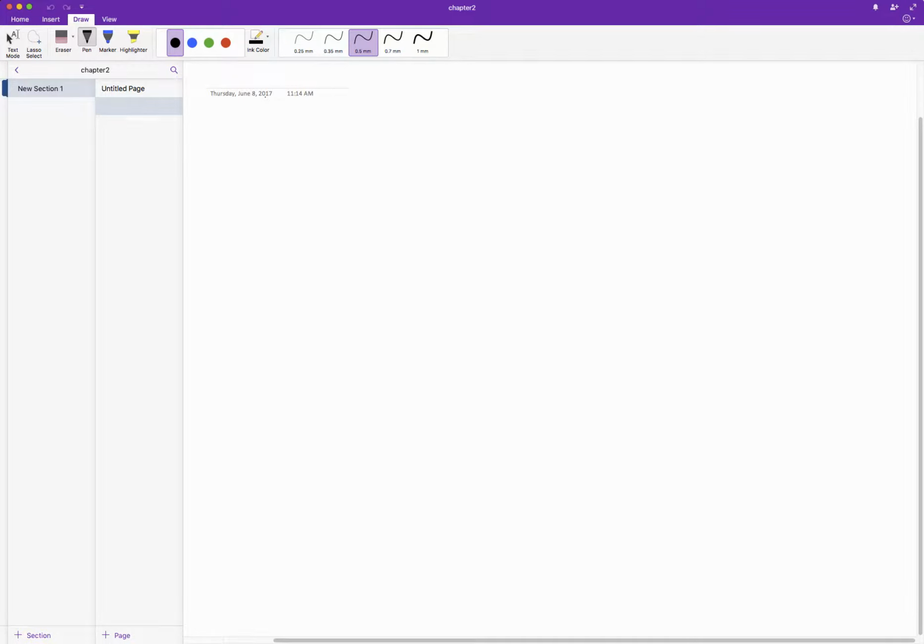So this is part 2 of chapter 2, and today we're going to discuss why ppm is the x-axis for NMR. So that's parts per million.